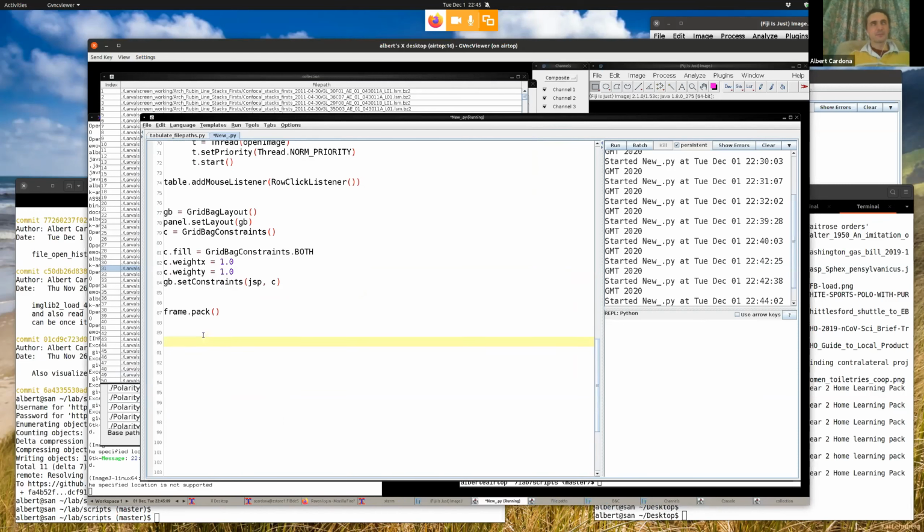So a filter would be, we need a text field where we typed our filter. And then what we type in that filter, we can either match the string, which is the simplest thing to do, or we can make it work with a regular expression. Let's see how we get there. First of all, we need a field. So this will be our filter field.